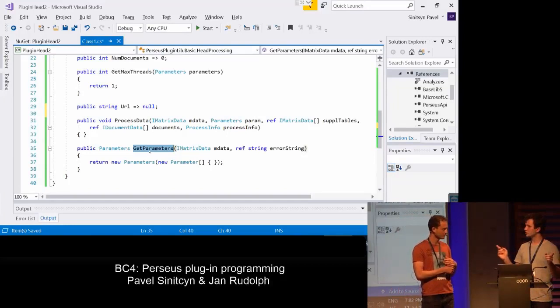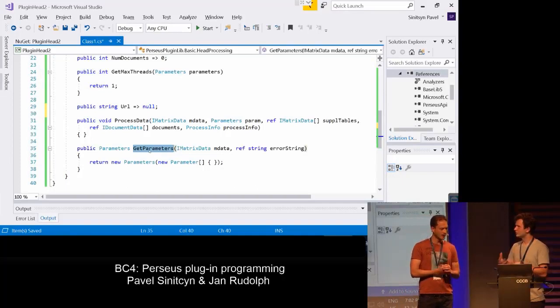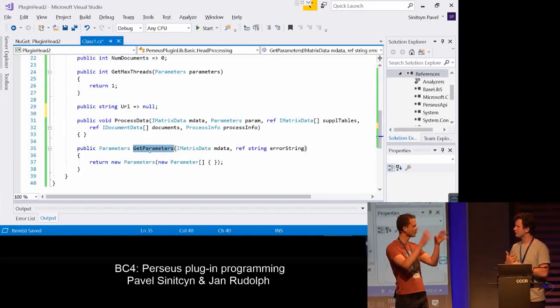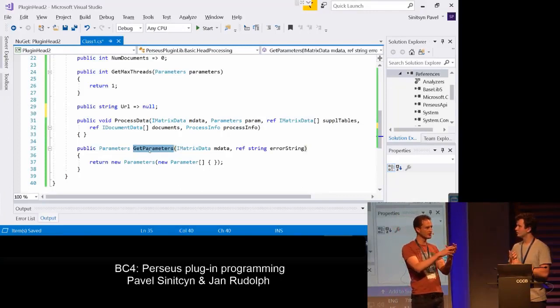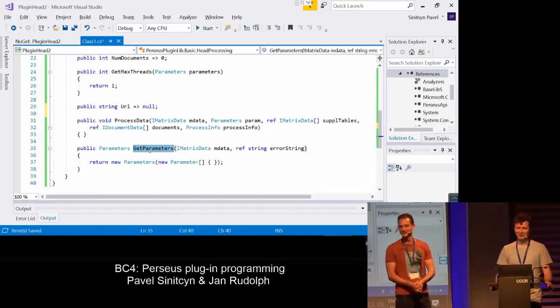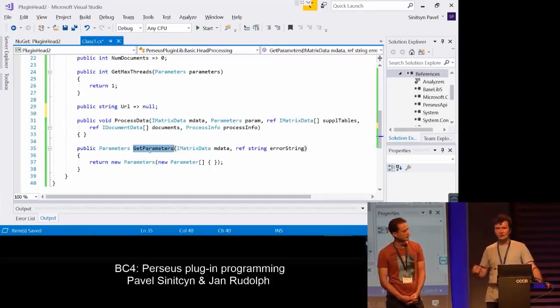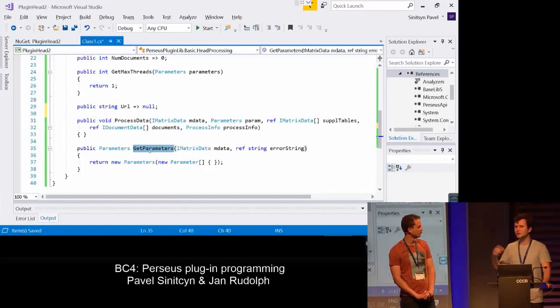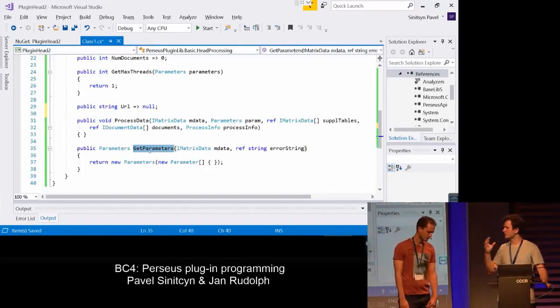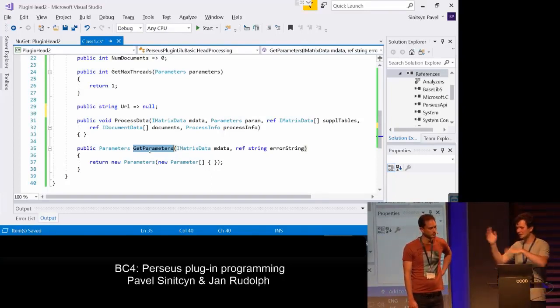And a good question: what does it mean to create, build a project? What we need to do is change the text representation of the code into something that the machine will understand. About 50 years ago, how was this process named? Yeah, compiling. That's actually how MaxQuant also works. We compile MaxQuant and give it to the public, people load it and run it, and when you click on MaxQuant, you are taking this compiled version and processing it into another compiled version, and everything runs beautifully.